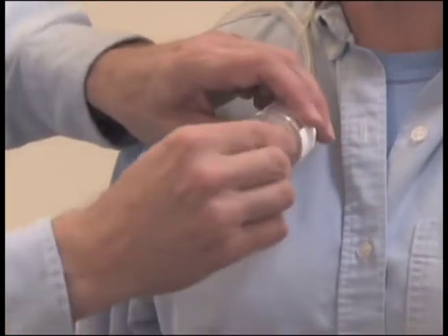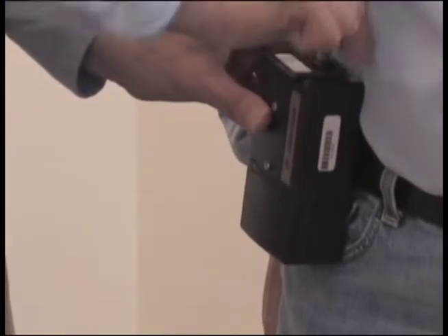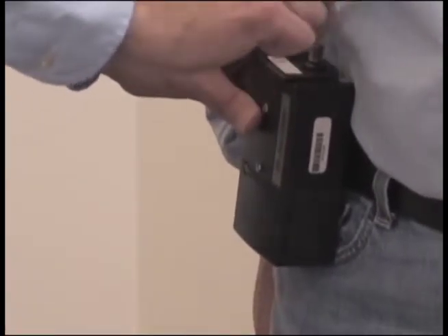Remove the colored nib from the inlet side of the filter cassette. Turn on the pump and record the time to the minute that you started the pump on the field data sheet.